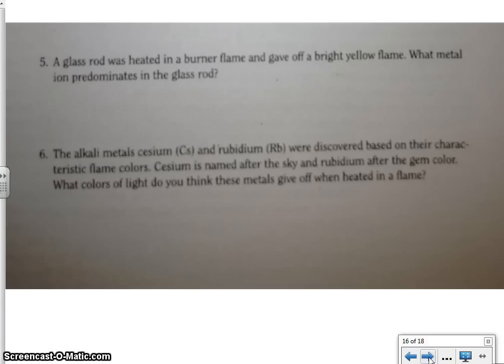Gas, of course, needs to be turned off all the way. Make sure you push that handle back all the way until you feel it stop. Either direction, to the left or to the right, will work. Just make sure that you push the handle all the way until it stops. There's 2 post-lab questions I'd like you to do after the lab is done. Numbers 5 and 6. Please answer these questions in complete sentences.